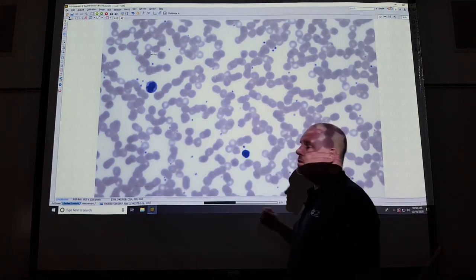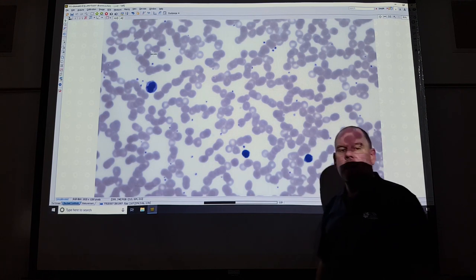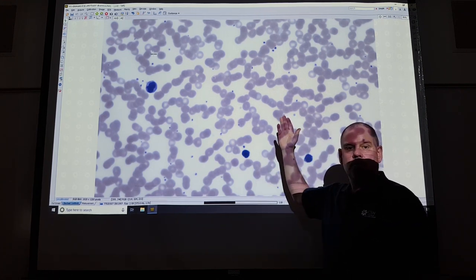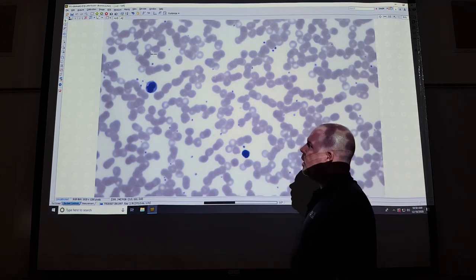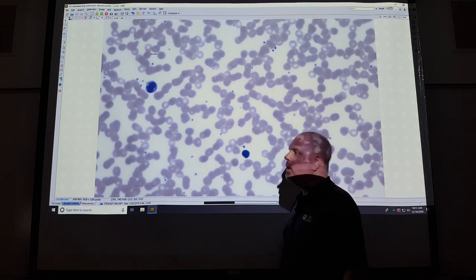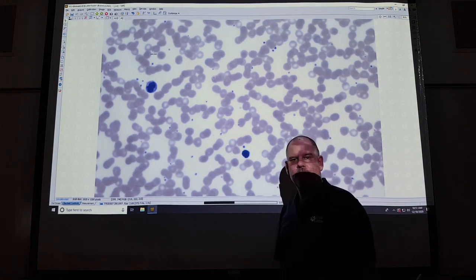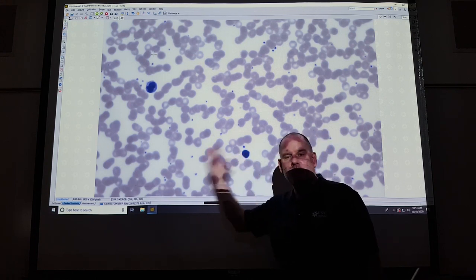Here we have our last connective tissue. Again, a 60 mile an hour tissue. Easy to identify: blood. The one mistake that students will always make on a quiz or a practical or a lecture test, hint, hint, for all of you, is they won't know how to classify this tissue. It's a connective tissue. So if I ask you to name this tissue, the name is blood.